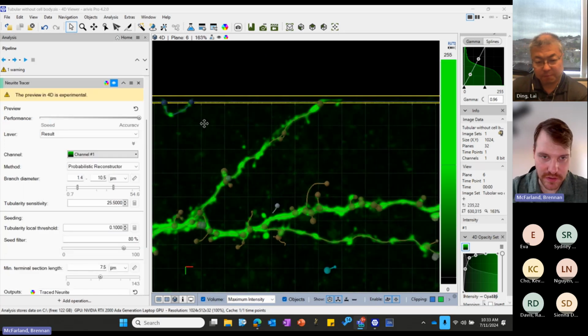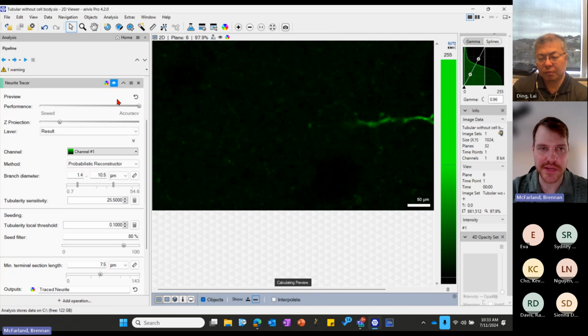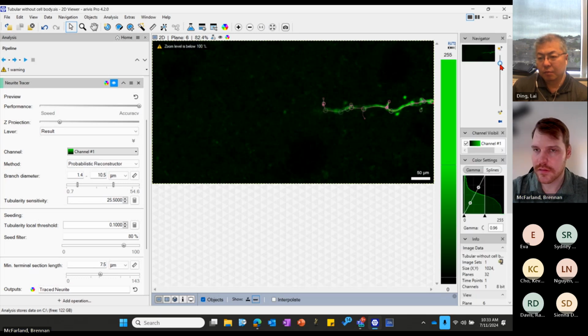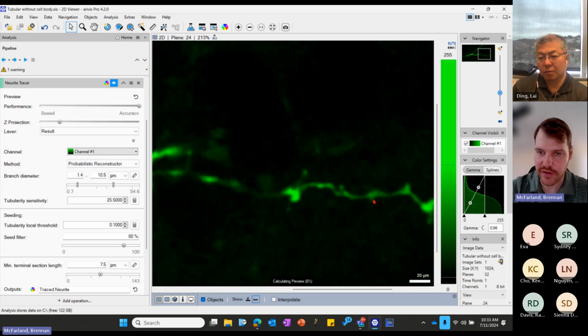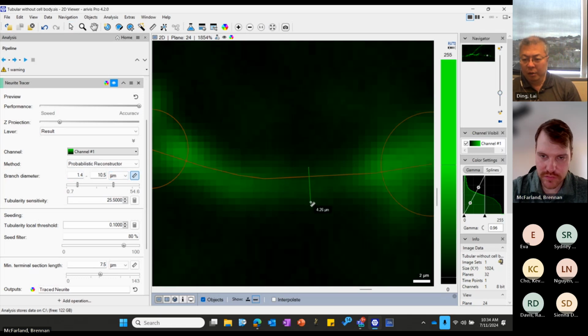So let's set something up here. This would be easier if we go now in 2D, because then we can use this ruler tool to measure our objects. This way we don't have to guess. So I'm going to find, these look pretty small in this area. I think this is one of the smallest ones. And it's already getting it, but let's just be sure.